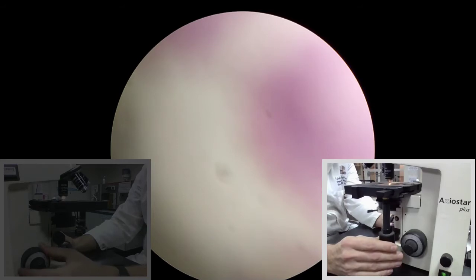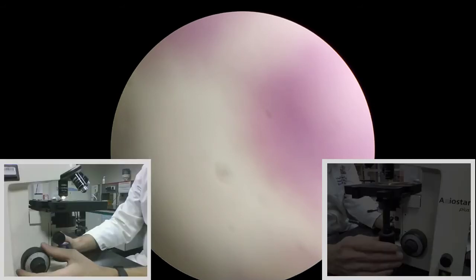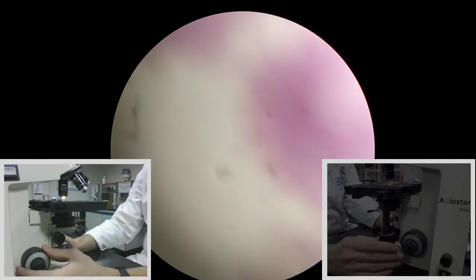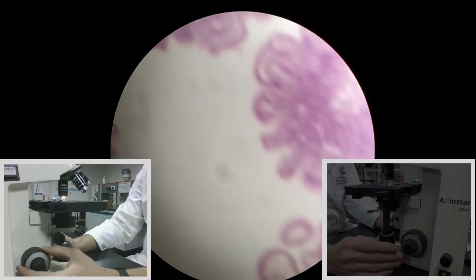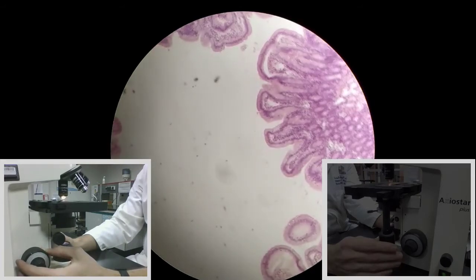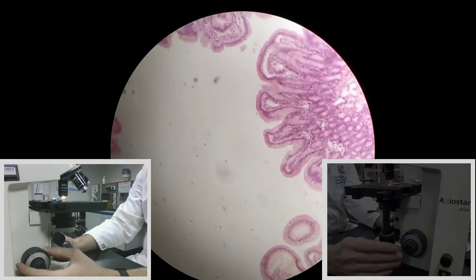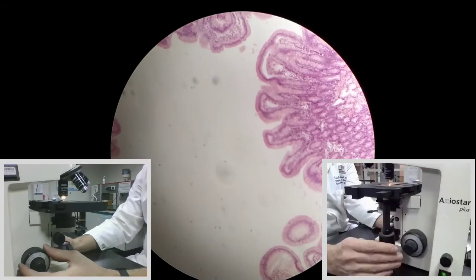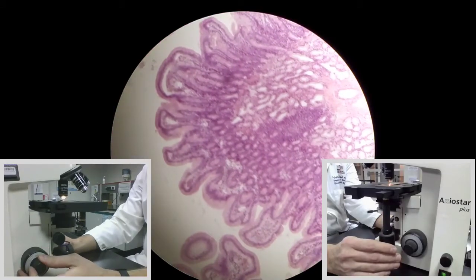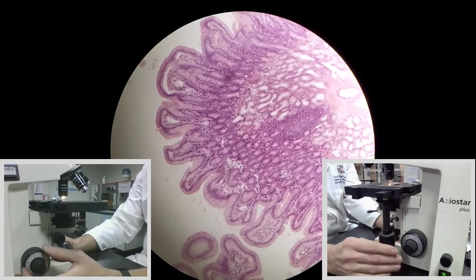Now that my stage is all the way up, there's only one way I can move the coarse focus knob or fine focus knob — and that's moving the stage down. So I'm going to start moving slowly. As I do that, I notice I'm starting to see things in a bit more focus, and I can adjust that using the fine focus if needed. At low power, I really don't need to use the fine focus very much — coarse focus is usually perfectly fine.